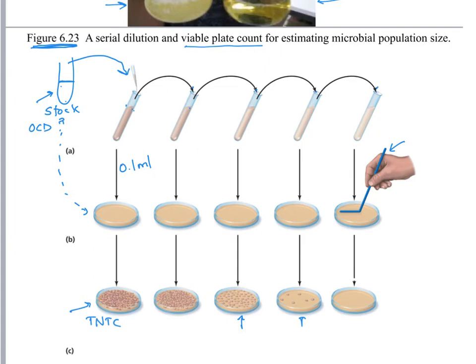So we have rows of 5 working together. That way everybody only has to make one dilution rather than everybody doing all 5 and everybody having 5 plates. So typically in this lab we work together. 0.1 mil is generally about a drop or 2. We take that out with a pipette and just measure it as accurately as we can.